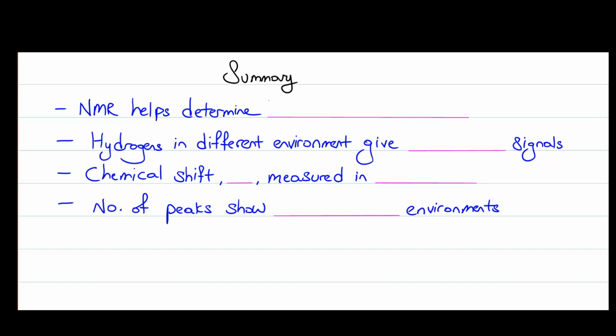So in summary, NMR helps determine molecular structure. Hydrogens in different environments give different signals.